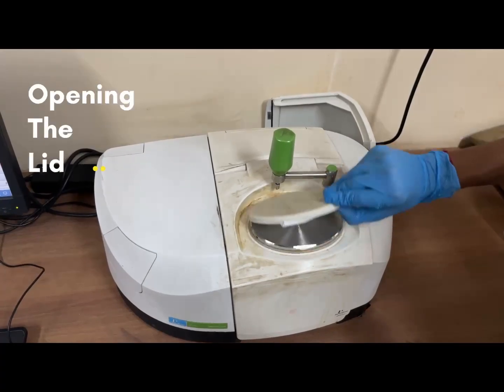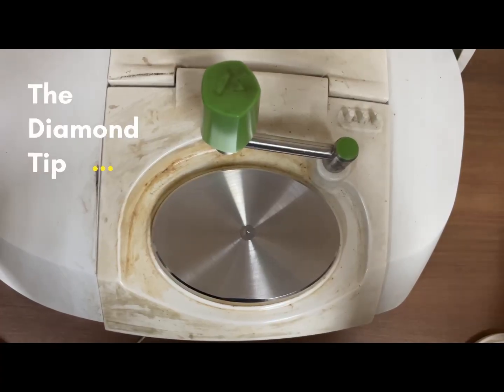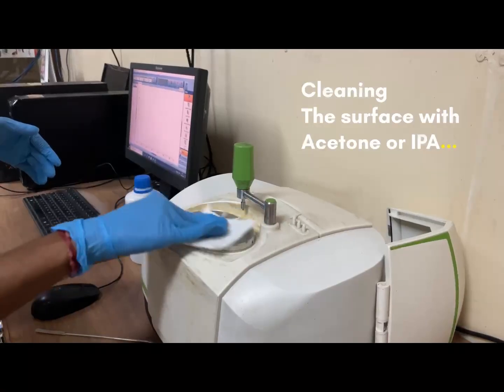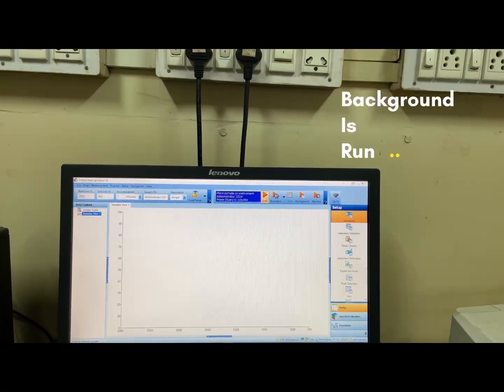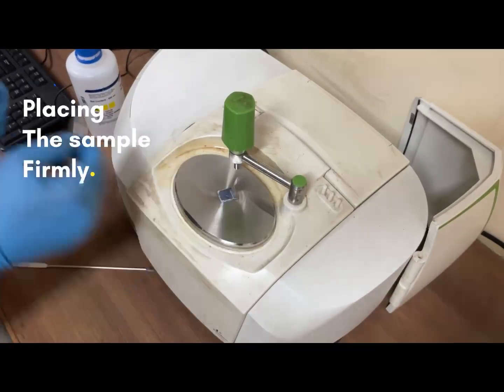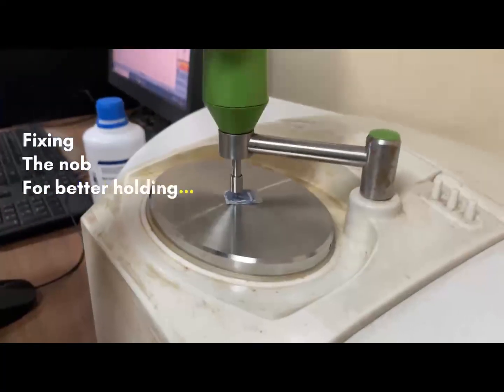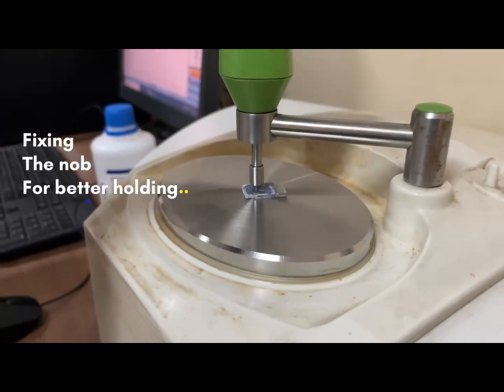How to handle the equipment? First, open the lid, clean the surface with acetone or IPA, then run a background scan with no sample on the crystal. Place the sample on the ATR crystal ensuring full contact. Then apply gentle pressure using the pressure arm.